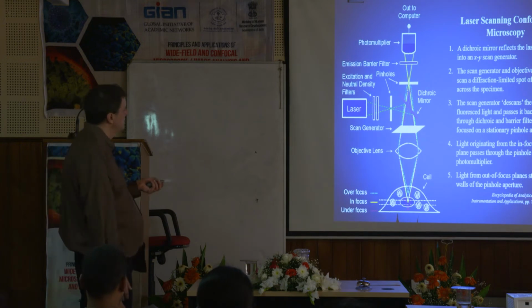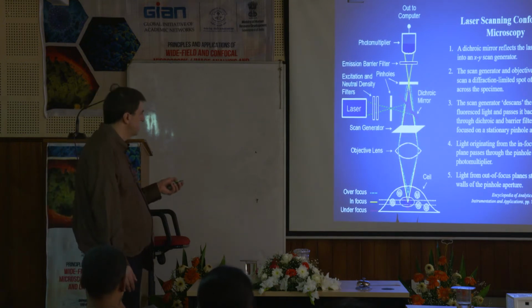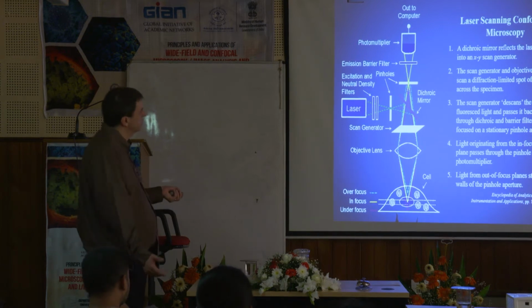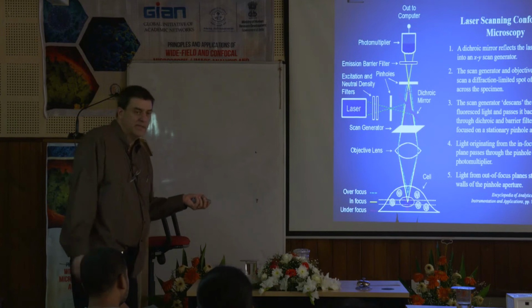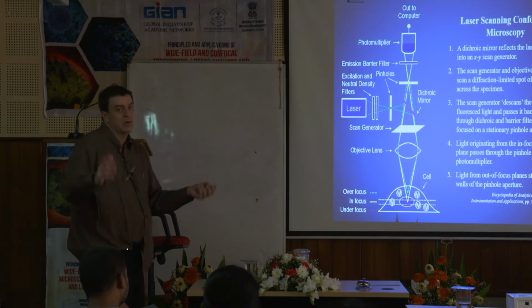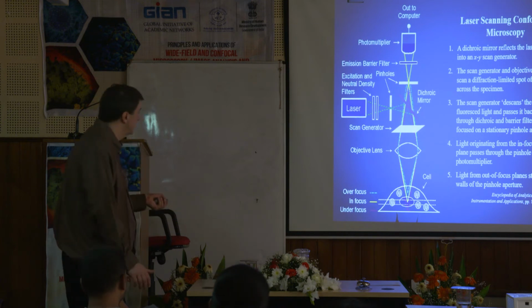Okay. So again, you can get into the physics of it. You can go crazy with it. There's a lot to it. But for biology, you basically just need to know, hey, it comes through a pinhole. We excite at one wavelength. We collect an emission at another wavelength. And that's pretty much how it works for a biologist.